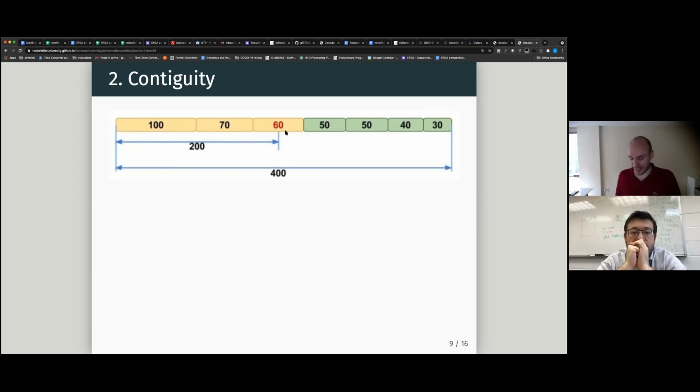I think you can imagine how confusing this is if you then have to compare these numbers between assemblies. But this is used everywhere by everyone, so it's something that you must know. For some applications it makes sense.